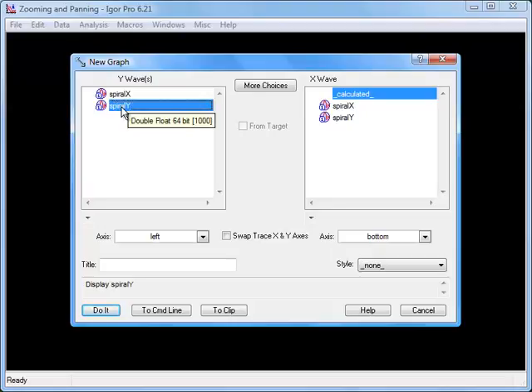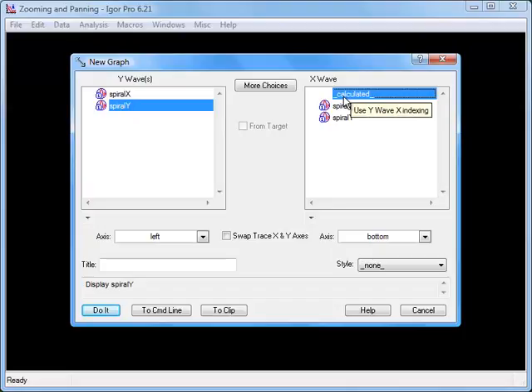In the X Waves list, select Calculated. Then click Do It to create the graph.